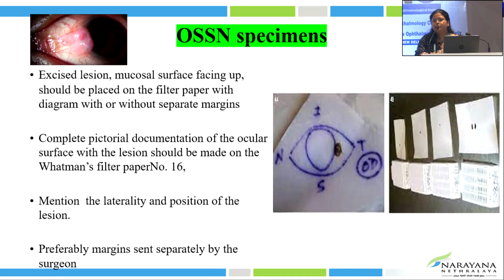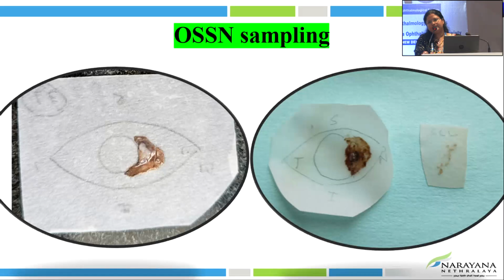Don't immediately put it into formalin. And please send it to us with the marking. Even better if you separate out the margins and send them to us. Otherwise, it's fine. We can always mark the margins, cut it across, and separate the margins. And she's already highlighted the base, or if you suspect that some scleral fixation is there, please send that separately in a small vial or on a separate paper. That helps.